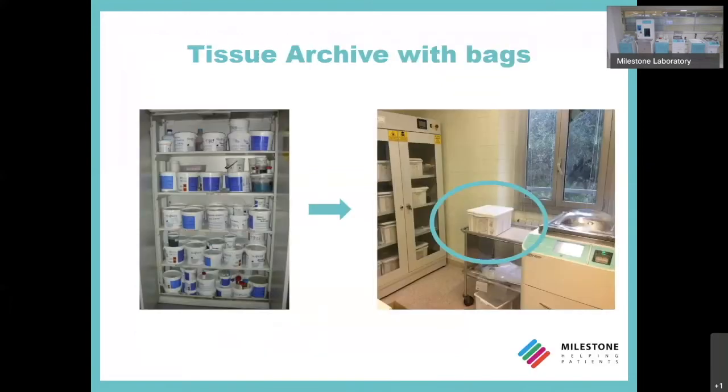On that regard, I have a couple of pictures. The one on the left is a classical archive of buckets with all the tissue stored in the pathology department. On the right is a picture from one pathology department showing the vacuum packing of tissue during a day. The remaining tissue of the day was put in a plastic bin with a list printed by the machine itself, with the identification numbers of all the cases in that bin.